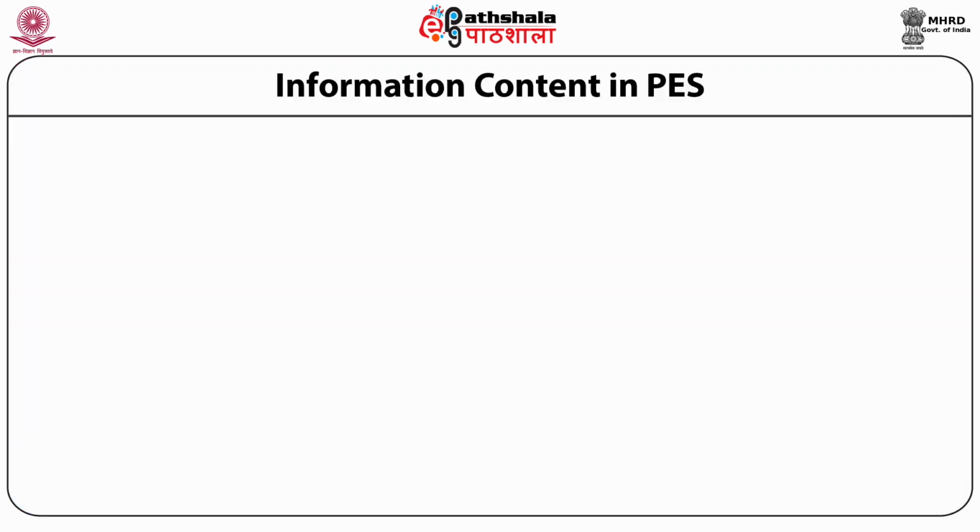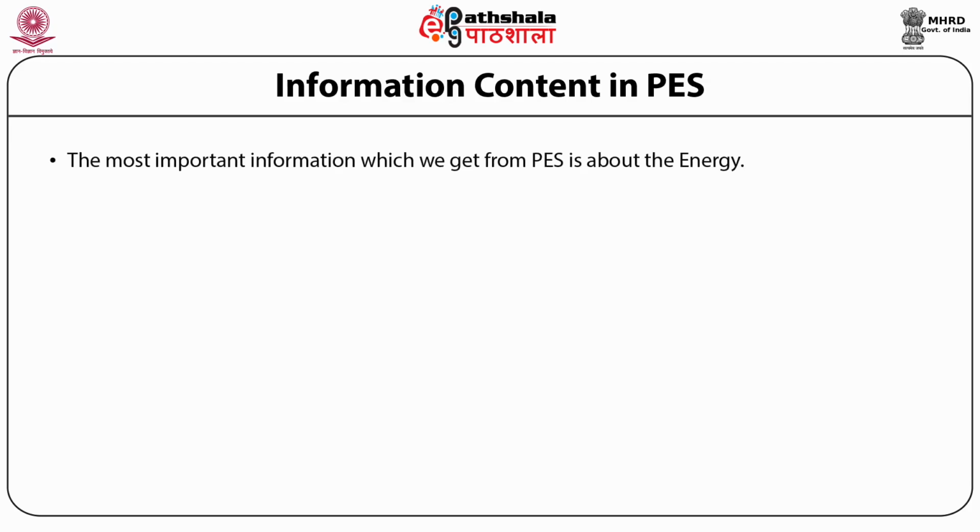Then we come to know about the information content of PES, which we get from photoelectron spectroscopy. The most important information which we get from PES is about the energy.